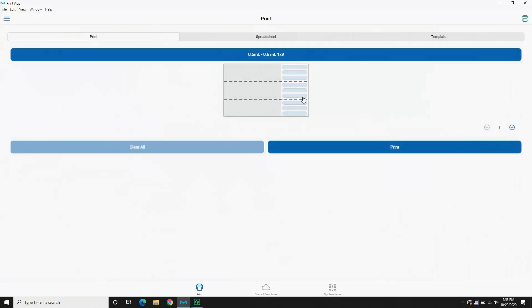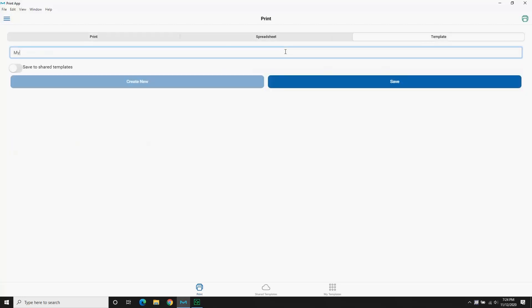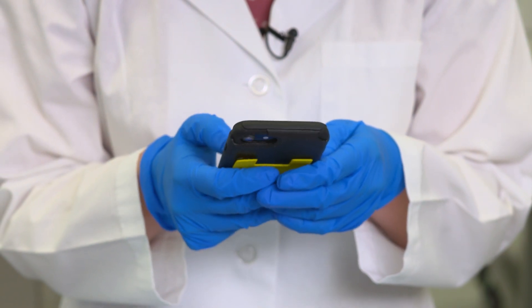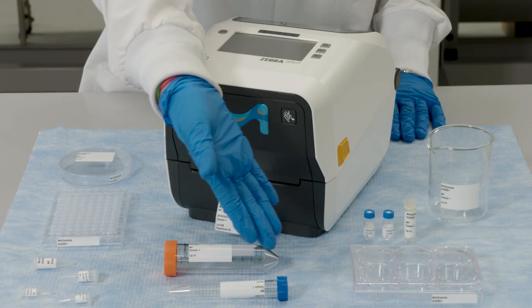Our custom-designed software provides ready-to-go printing with specifically designed templates for laboratory vessels. The balanced system provides options for quick printing, printing from a spreadsheet, or setting up templates to streamline label creation. The Mill Essentials Lab Labeling System provides a ready-to-go, intuitive lab-based system to streamline your labeling workflows.